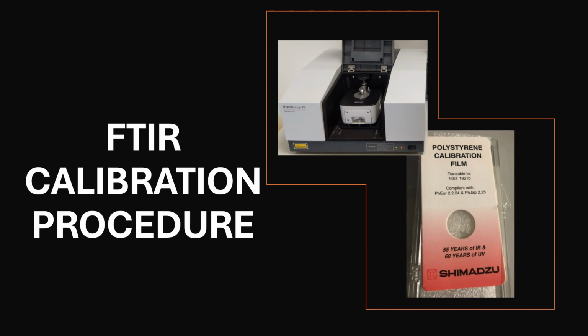So today we'll discuss the FTIR calibration procedure. FTIR is a widely used analytical technique for material identification and quality control. Calibration of the FTIR ensures accuracy, reliability and compliance with regulatory and quality requirements. I have already made a video on the basics of FTIR and its operation in my last video. So this presentation introduces FTIR calibration in maintaining reliable analytical performance, right?